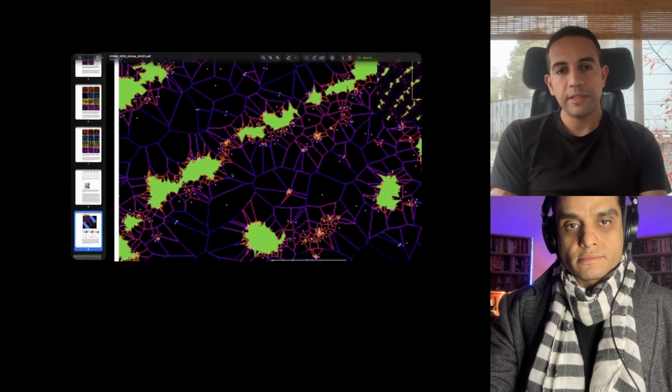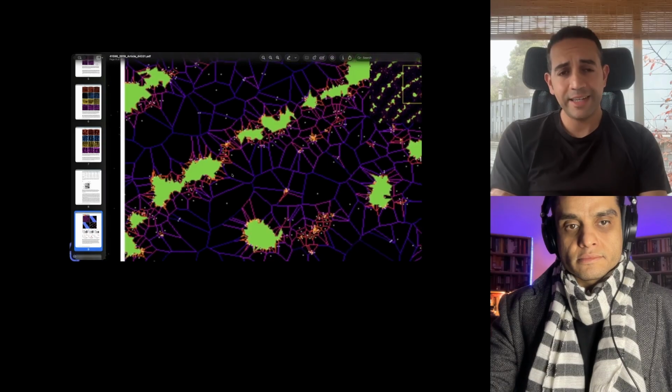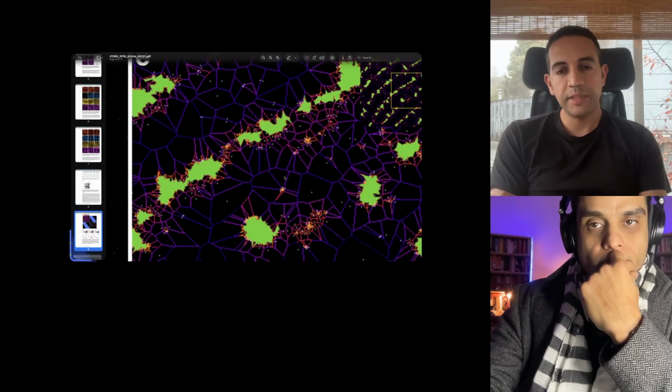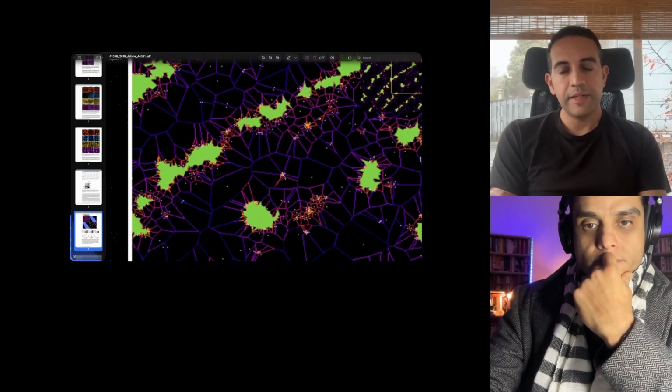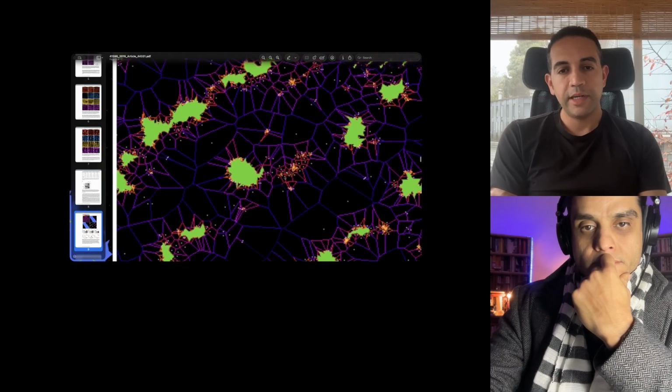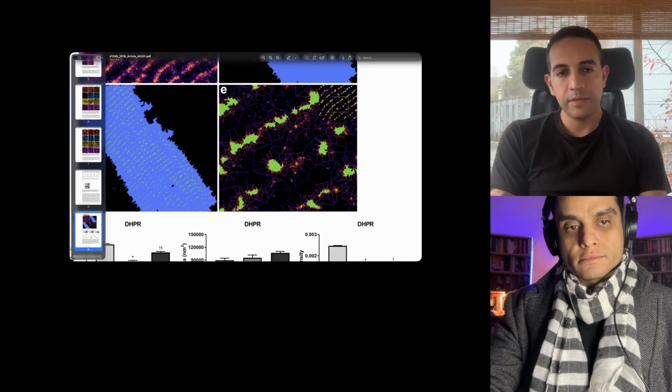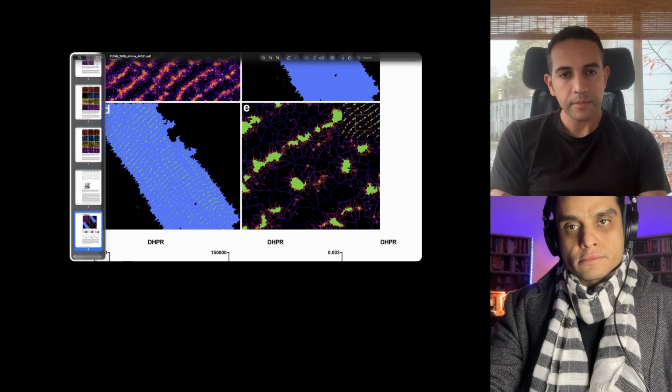And what you can do is start looking at their size. Are they more merged? Are they more isolated? So that was one thing that we did. So as you disrupt the phenotype, how are they organized along those lines? So you just report on that, first thing.